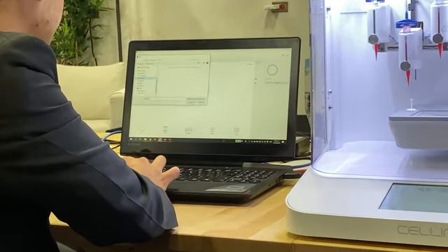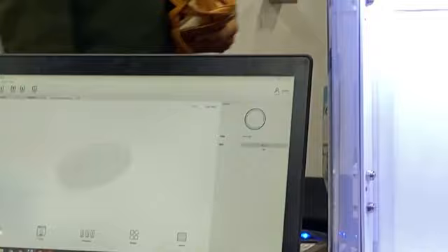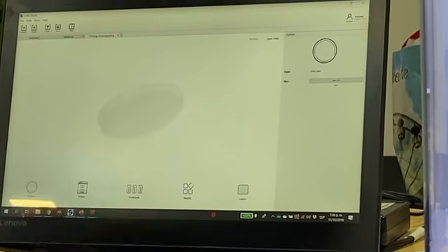So, it is called the DNA Studio, right? And you can print different kinds of things here. So you can search different structures. Let's see.